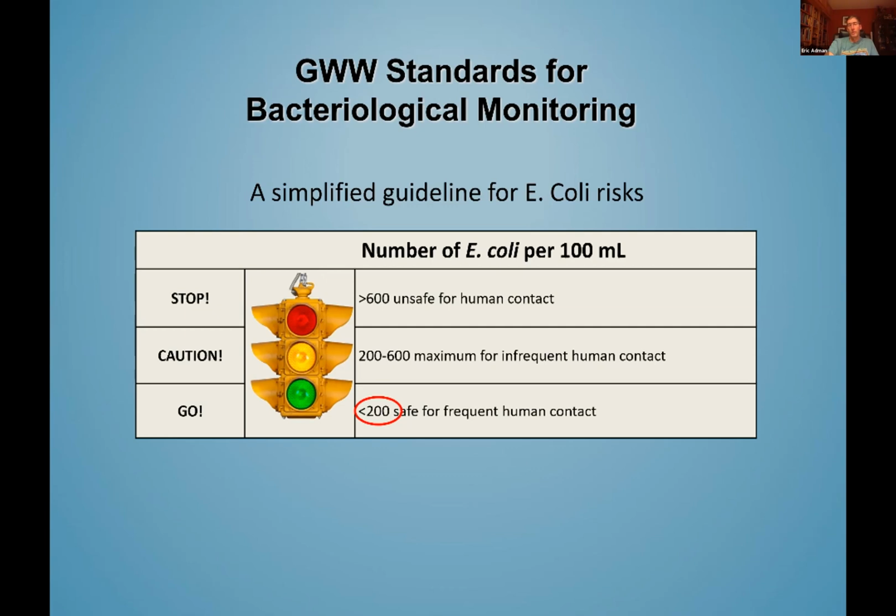Global Water Watch, in their training set, has some standards for bacteriological monitoring, and they have this stoplight graphic representing safe, be cautious, definitely unsafe. And so this is kind of their worldwide standard. What you find is that different jurisdictions have different standards.